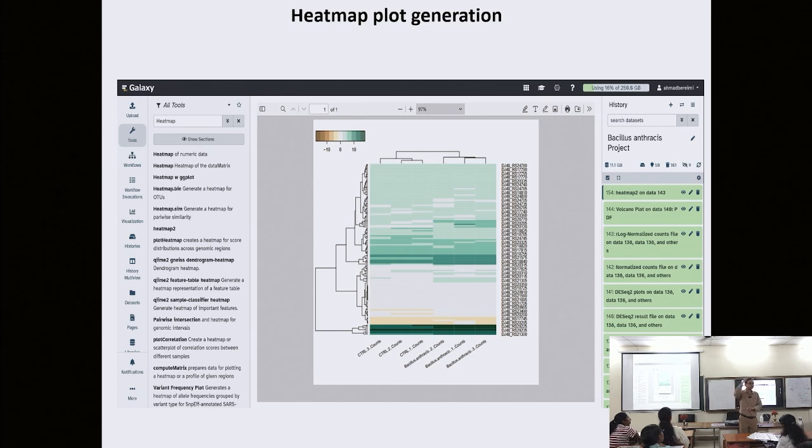So above the gene. Once you have found the genes, then you have to find the interactions between genes and identify the pathways that are differentially expressing under a certain condition. Okay. So yeah, if you are interested, you can read my paper published, I think, in 2023, a gene network for Pseudomonas aeruginosa. Go to PubMed and you will find it. I can show you that.